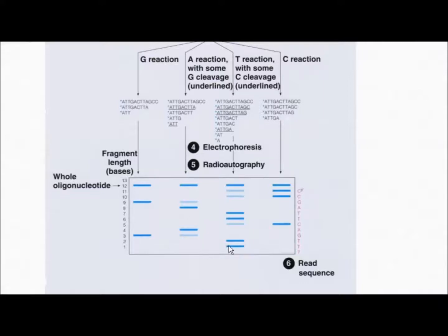So now you know that an A is attached to a T, and because you know exactly that ATT is attached here, that also tells you that an ATT is attached here. That means you now start building your sequence from the fragments. And now this is ATTG, and so you know there's an A, an AT, an ATT, so that's one. So you know that's ATTG, and then you know that there is another A here.